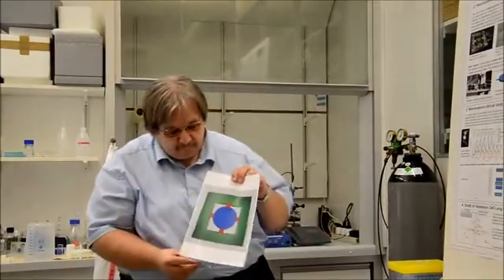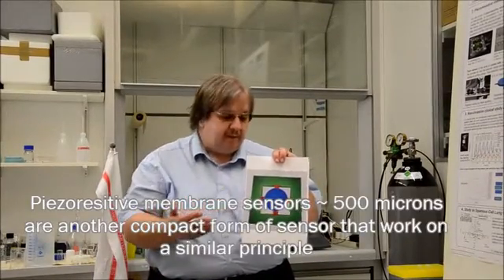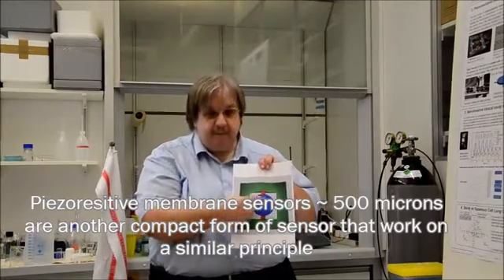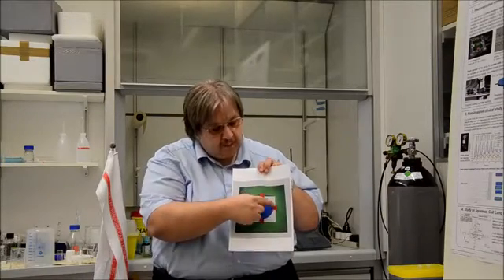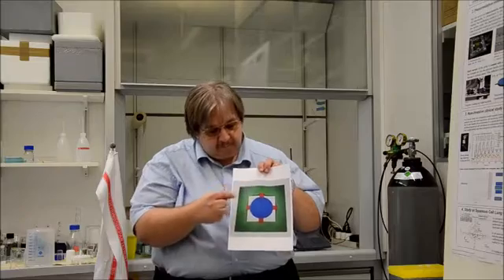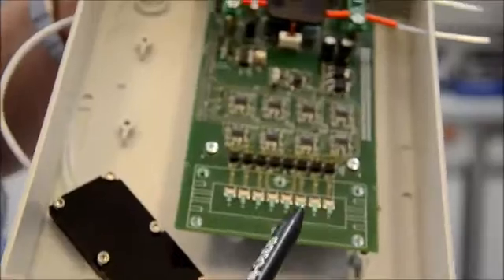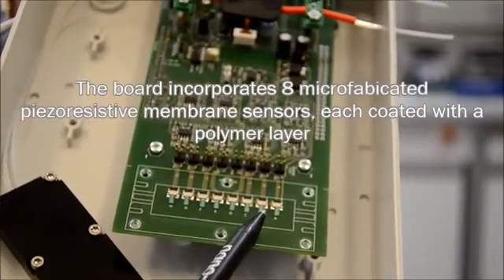We did this in the beginning with cantilevers. But later on, we found another interesting and compact form of sensor, which is similar in function as the cantilevers, but different in concept. This is a piezo-resistive membrane, which is held here by these four bars in red. These are piezo resistors. And the whole sensor is within this green frame. Here we have an array of eight microfabricated membrane sensors.